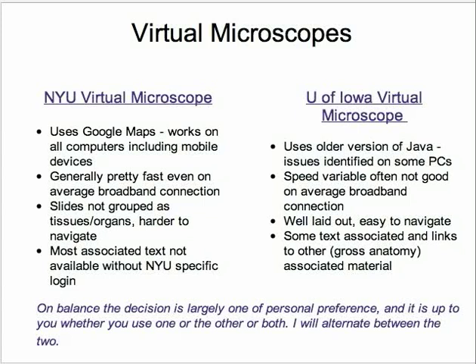On balance, then, the decision as to which one of the microscopes that you wish to use is entirely up to you and is a matter largely of personal preference. In the little video clips which I'll provide you with, I'll alternate between using one or both of them.